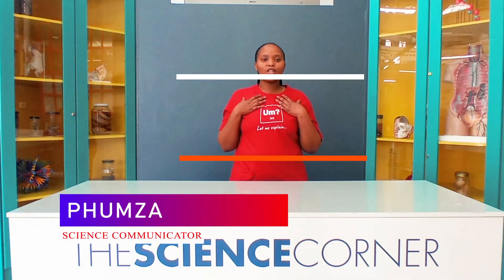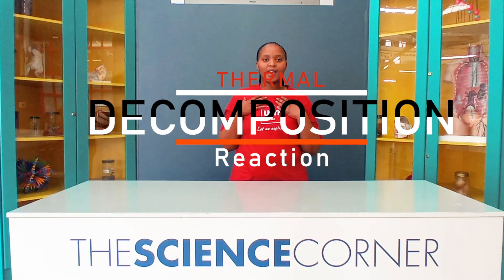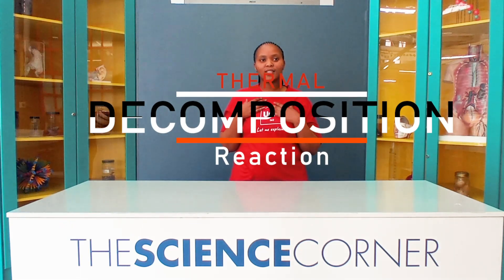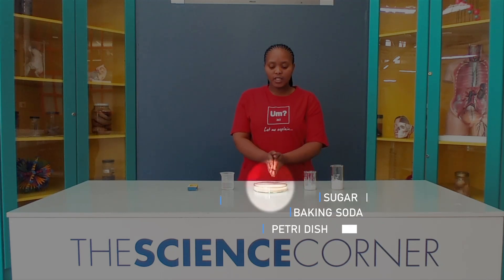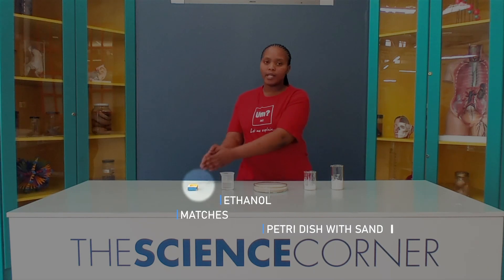My name is Punza and today we will be exploring a thermal decomposition reaction. For this experiment we will be using sugar, baking soda, a petri dish with stand, ethanol and matches.